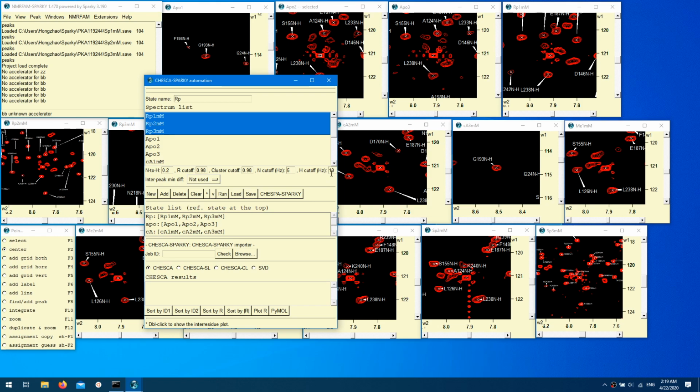Additionally, there is an optional filter to eliminate errors derived from signals that are too close to each other. You can either use the user option to input the chemical shift difference by yourself. The default is set at 0.05 ppm, or you can use the average line width, but it requires you to integrate the peaks before you start. Here, for this example, we are just using the 0.05 ppm as the default here.